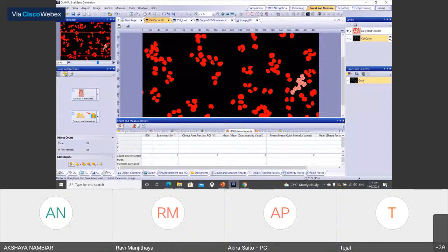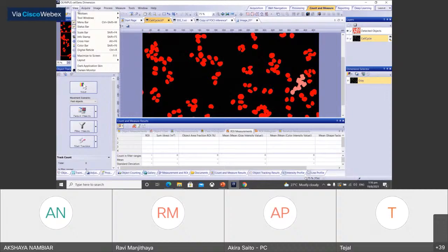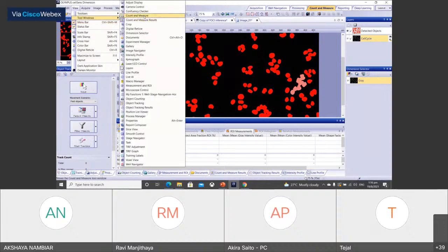Anyway, if you have CellSense Dimension, I think you can see this tab, and by default there is this tab in CellSense Dimension. This is the default position, but of course it can be closed. If you cannot find it, you need to go to View, find the Tool Window, and go to Count and Measure.